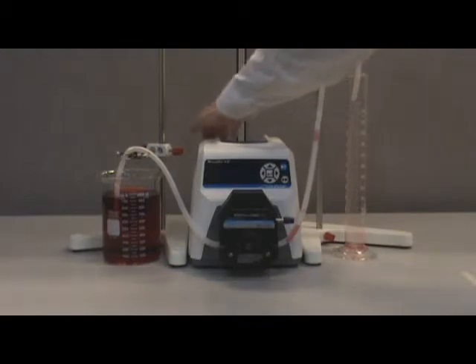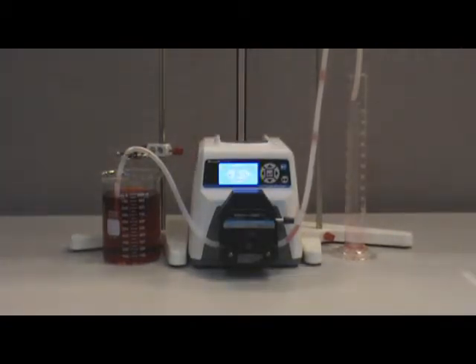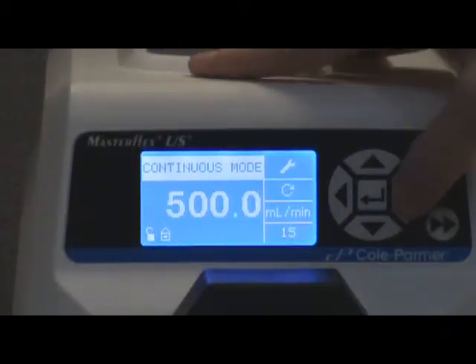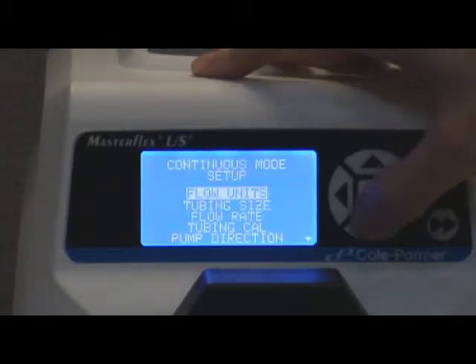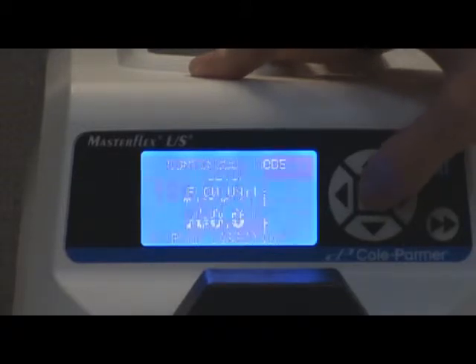The first thing that you will need to do is turn on the drive. Go to the main menu by selecting the setup icon and pressing the enter key. Use the up and down arrow keys until tubing cal is highlighted, then press the enter key.